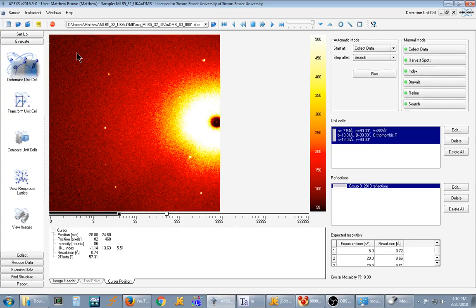This enables a fast search of the CSD Cambridge Structural Database from within Apex3 which encourages users to actually check if their crystal is something that's already known and enables you to do that check even if you don't have access to the full Cambridge Structural Database.